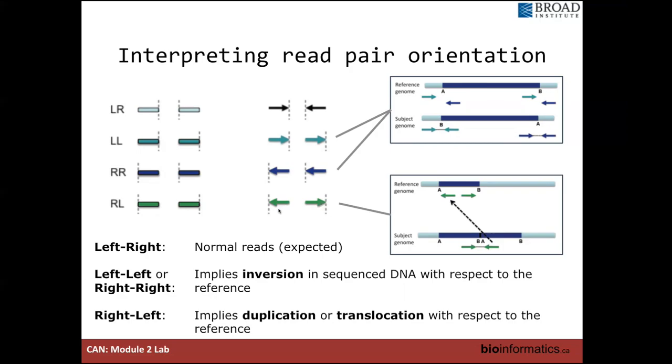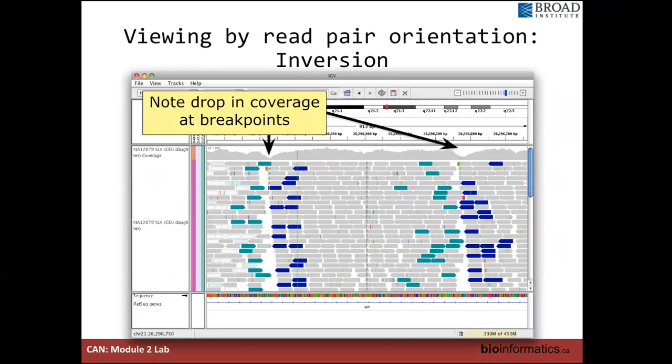And if you have reads kind of facing the opposite way, if they're going right-left, this might be indicative of a tandem duplication, as depicted here or as a translocation within the same chromosome. So in this example, this is an inversion. We've colored the reads by read pair orientation. And so we can see there are a bunch of reads in incorrect orientations, but their mates as well. You can look at the coverage track and see that there is a drop in coverage around the same position. So you can use multiple tracks to kind of confirm or validate what might be going on in a particular sample.